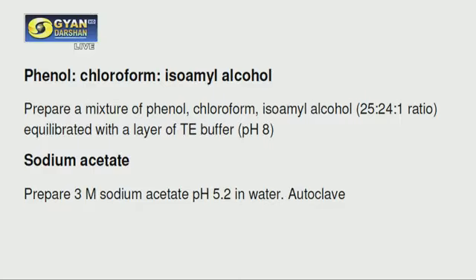So all the chemicals or all the buffers that you use should be properly prepared and autoclaved. Without autoclaving you cannot do it, because otherwise the DNA will be degraded. So you have to prepare all the buffers, autoclave them, and also the glasswares and the plasticwares that you are using. Even the water, not only double distilled water, has to be autoclaved, sterile, and then you can perform the experiment. Now the procedure.